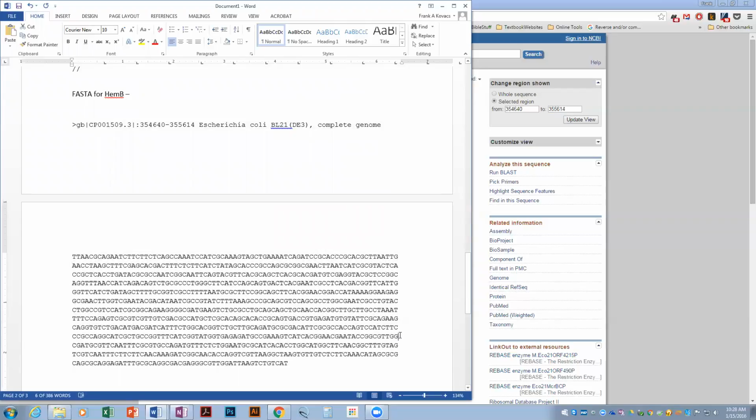Oh, it looks like I didn't get this one here. Let me just demonstrate that again. You see how I have this other little thing here? That looks like a space or a line return. So I'm going to delete that little bump, and it's gone. And so now I have it all as one line.